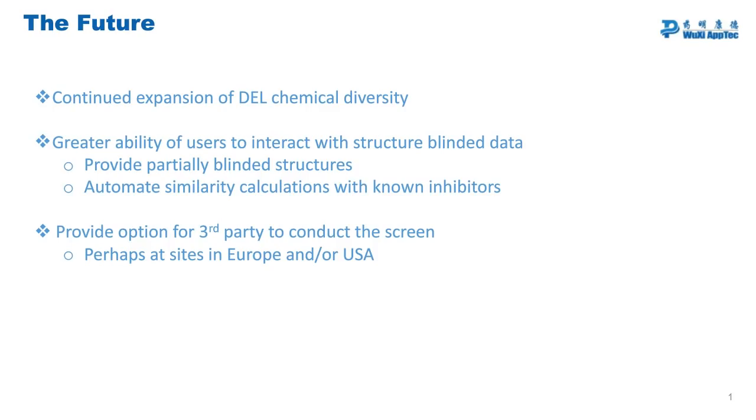And third, running DEL screens is a fairly straightforward thing, and it only takes a day. We understand that not everyone necessarily wants to do this. And while this option does not exist currently, in the future, we might be able to provide a third party who could run the physical screen for you. And we are curious about perhaps doing this in the EU or in the USA.